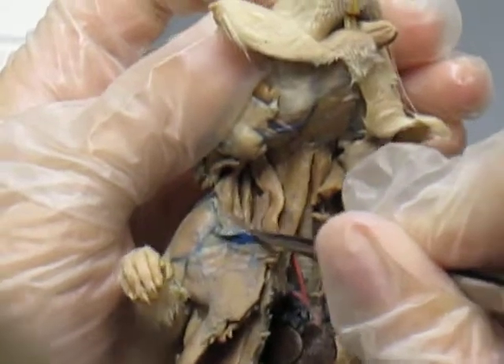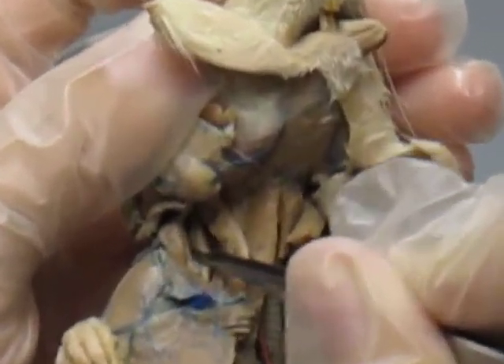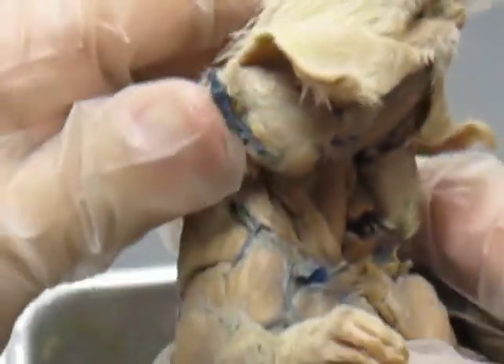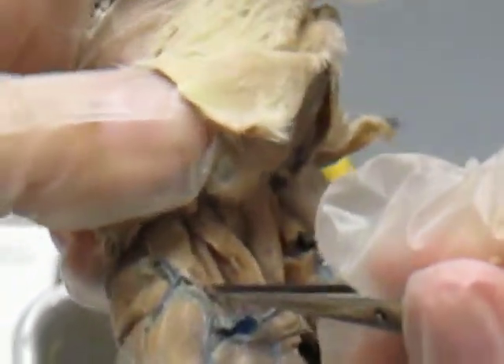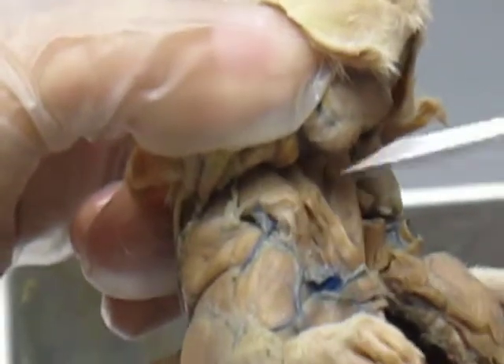The one going from your clavicle to your mastoid is your cleitomastoid. And another one that you should have seen last week is the one going from your clavicle to your cervical vertebrae — it's a cleitocervicalis.